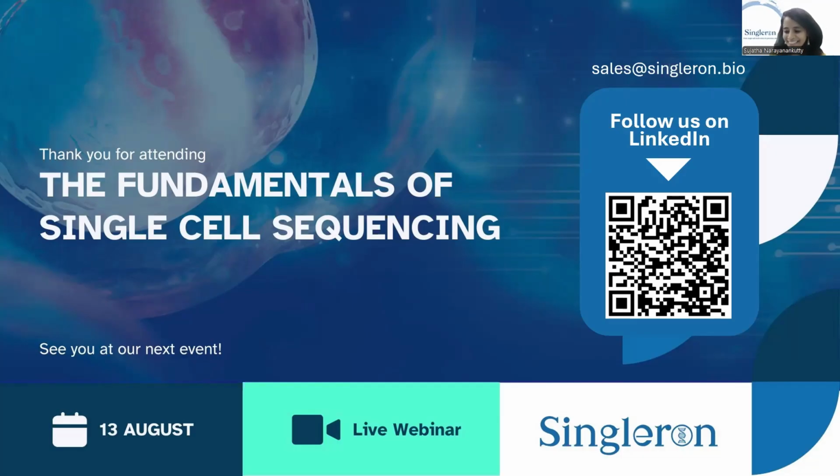There's a second question that asks, is there any data showing that epitopes on the surface of single cells are well preserved when we are using Python?